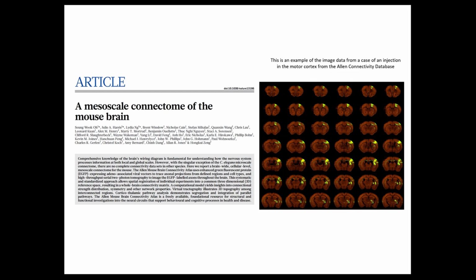My name's Chip Gerfen. I'm a neuroanatomist in Bethesda at the National Institute of Mental Health. And today I wanted to show how we use the NeuroInfo platform to make whole brain reconstructions from coronal sections, and then register those to the Allen Atlas.